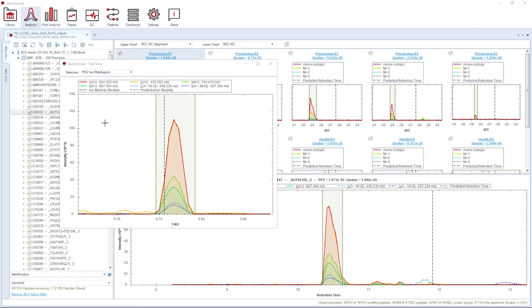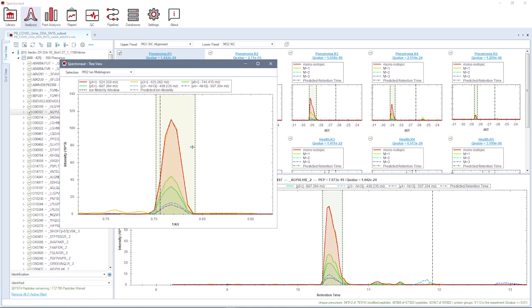For data that use ion mobility as a fourth dimension for ion separation, such as diaPASEF data, the Mobilogram is now available. The Mobilogram allows for manual peak integration in the ion mobility dimension. By reintegrating the ion mobility dimension, the retention time XIC also changes since it is built from what is contained in the ion mobility extraction window. If you want to reintegrate a peak, you can adjust the extraction boundaries and this will automatically affect the retention time XIC.